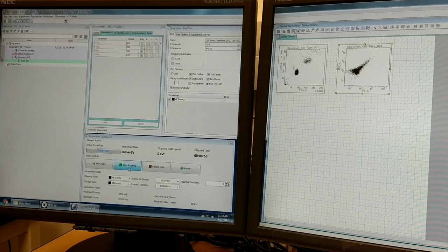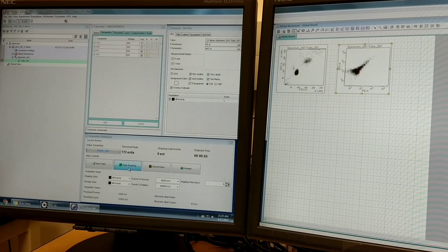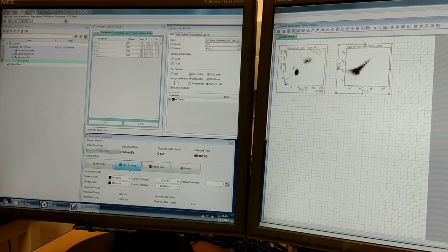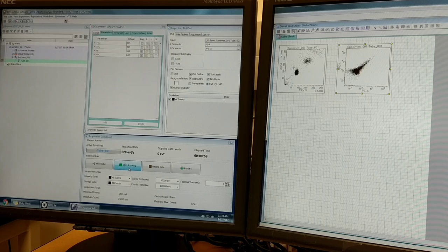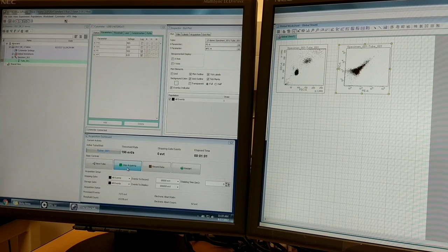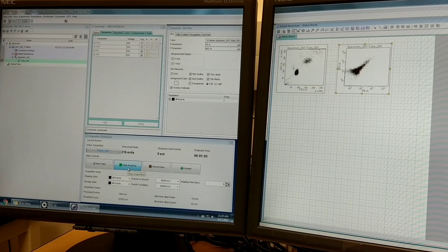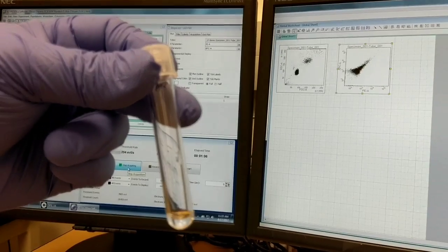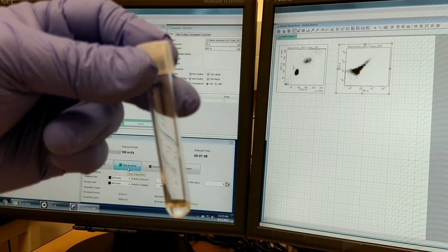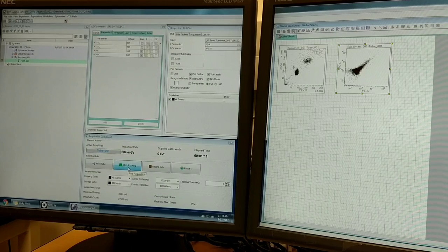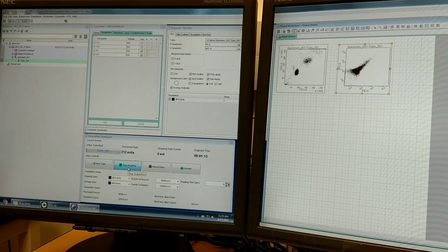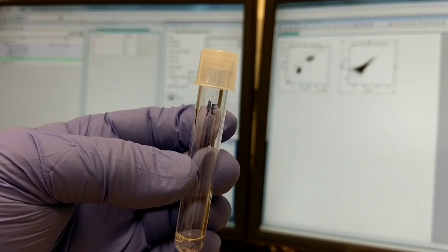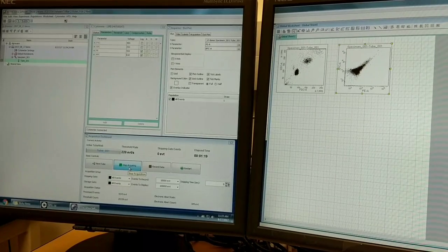A point about single stain controls: for every experiment you should have single stains for each fluorescent color you're combining, so you can do compensation appropriately. In this case I have one tube that has APC and unlabeled beads. It's important to have both a positive and a negative population for each single stain. Likewise for the PE tube, it has PE beads and unlabeled beads.